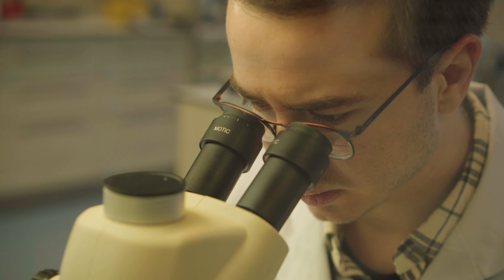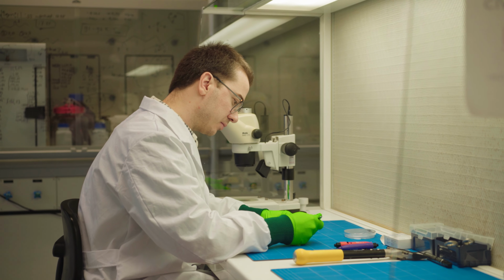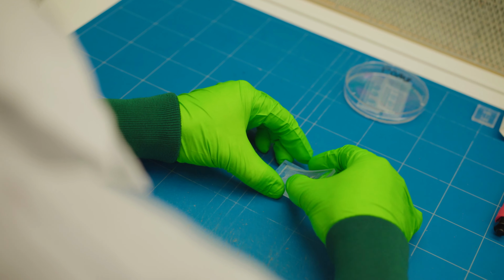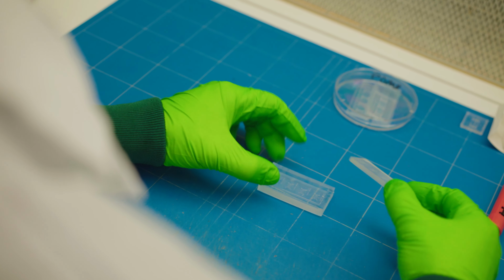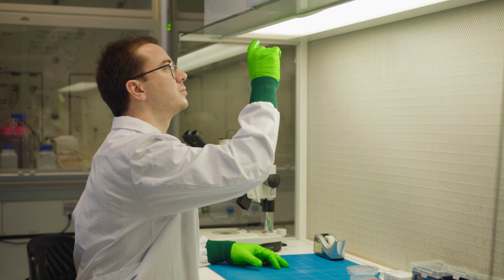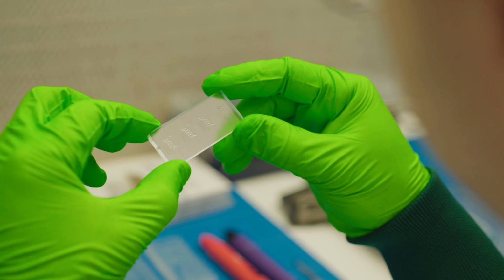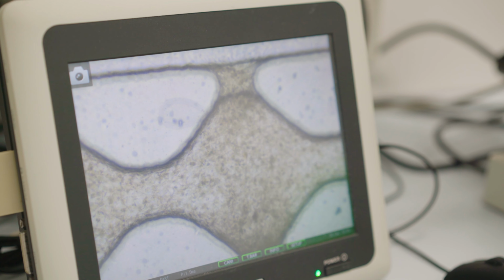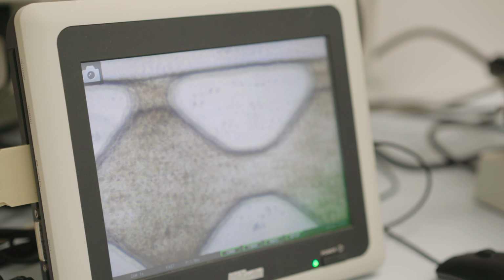Together with my group, we are developing innovative technologies and engineering solutions so that we can create miniaturized and advanced models for tissues, organs, and diseases. In our project, FibOoC, we are developing novel miniaturized models of fibrotic tissues without using any test animals so that we can better understand this condition, fibrosis. We are currently focusing on one specific disease, which is a rare disease, systemic sclerosis. This disease is initially impacting the skin, therefore we are developing a miniaturized model of a skin.